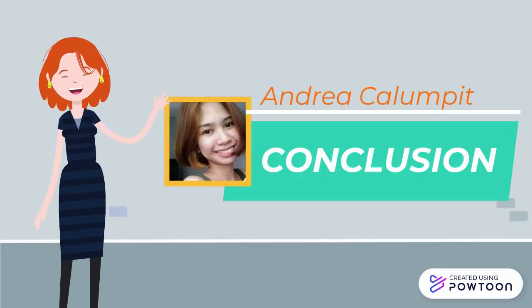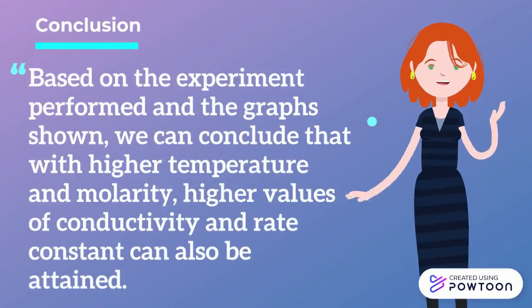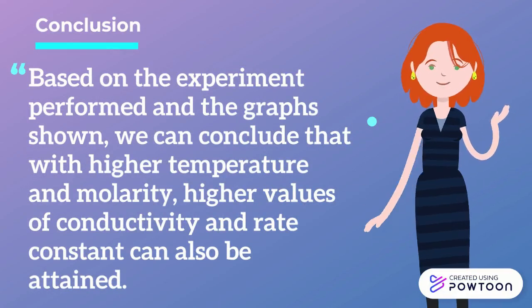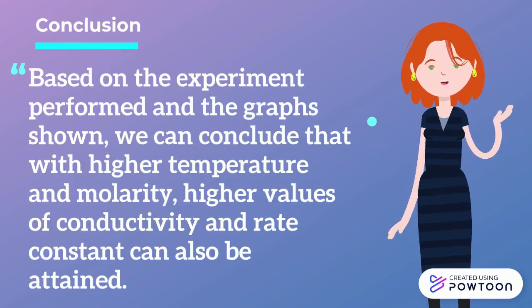To state the conclusion, let's hear it from Andrea. Based on the experiment performed and the graphs shown, we can therefore conclude that with higher temperature and molarity, higher values of conductivity and rate constant can also be attained.